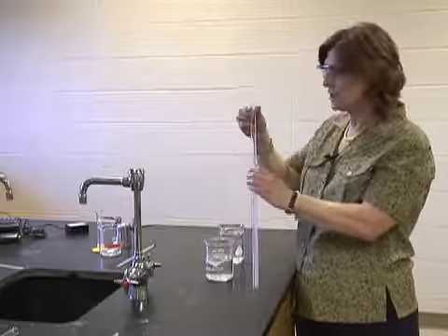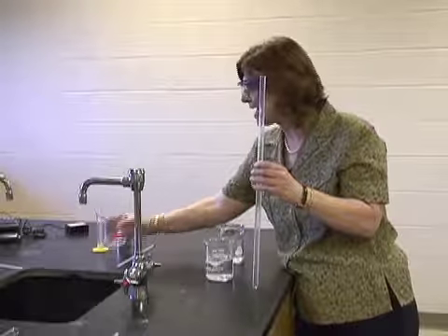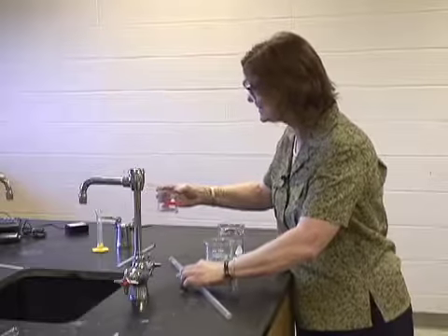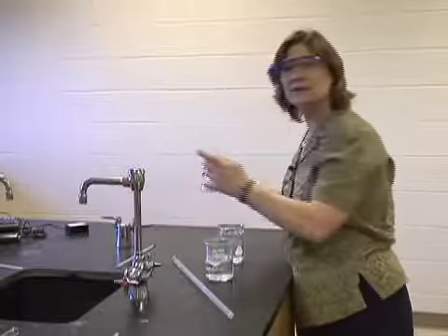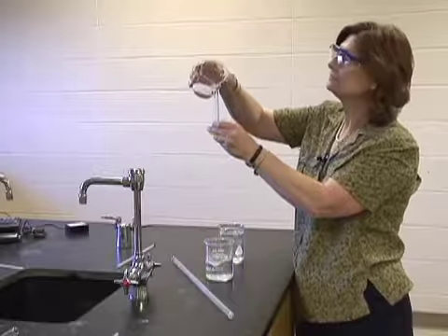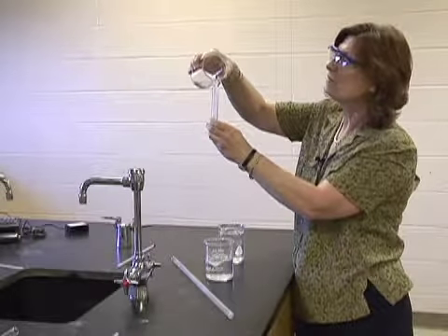Now I will take my eudiometer and I will add 10 milliliters of the hydrochloric acid into a graduated cylinder. And I will measure out 10 milliliters of my hydrochloric acid.